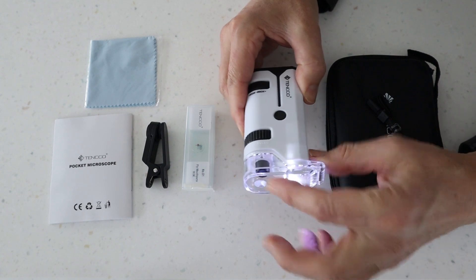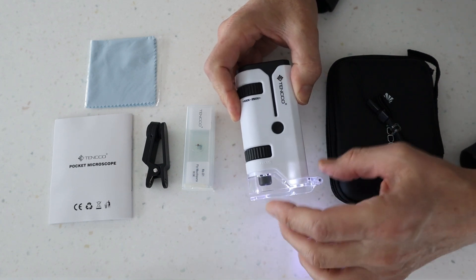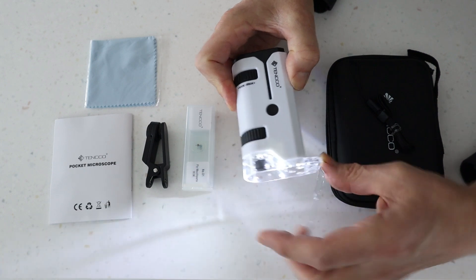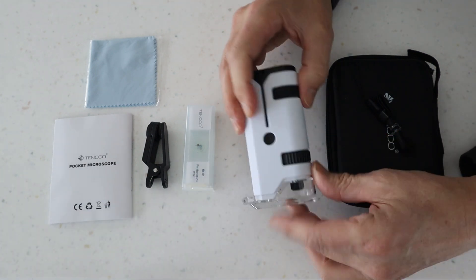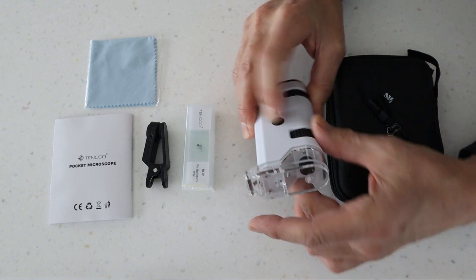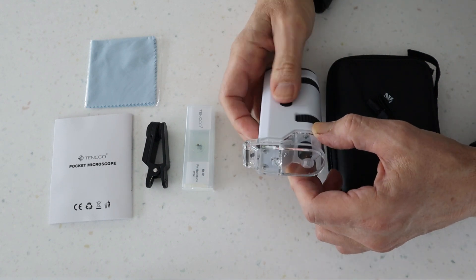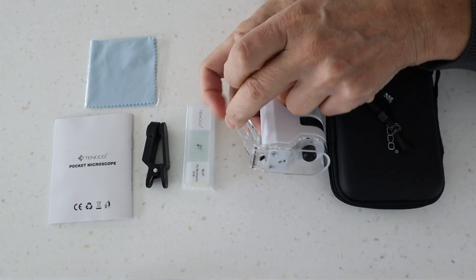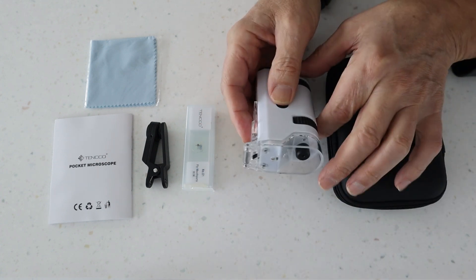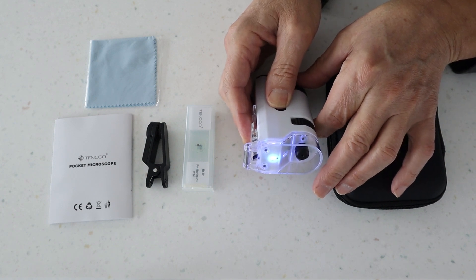For anything translucent, you'll want the flap down with the light coming from the side. For anything you want to view directly over the top, you need to open that flap up. With regards to the UV light, you simply press and hold the light button — and the flap needs to be open to use the UV light.